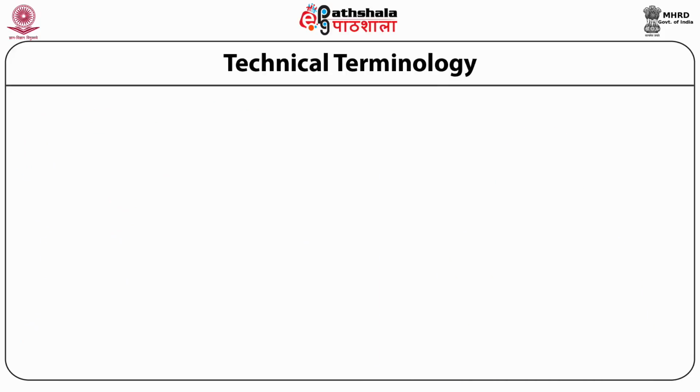So now, before we go into the details of the process and applications of gas chromatography, I will tell you a little bit about some technical terminology that is necessary for understanding the process. Of course, you must have heard the terminology before in the context, but it needs to be repeated in the specific context of gas chromatography.